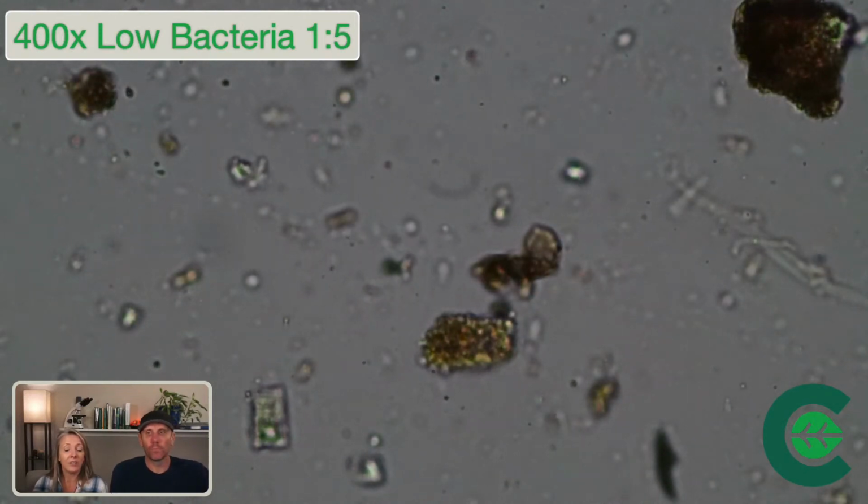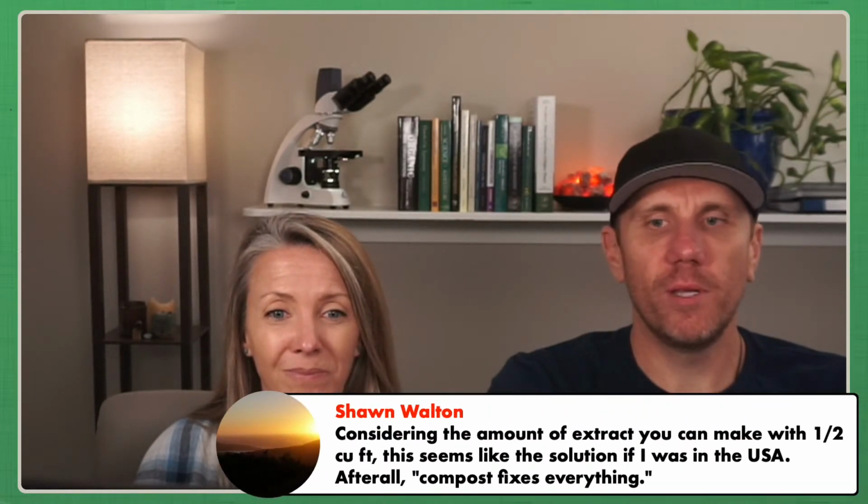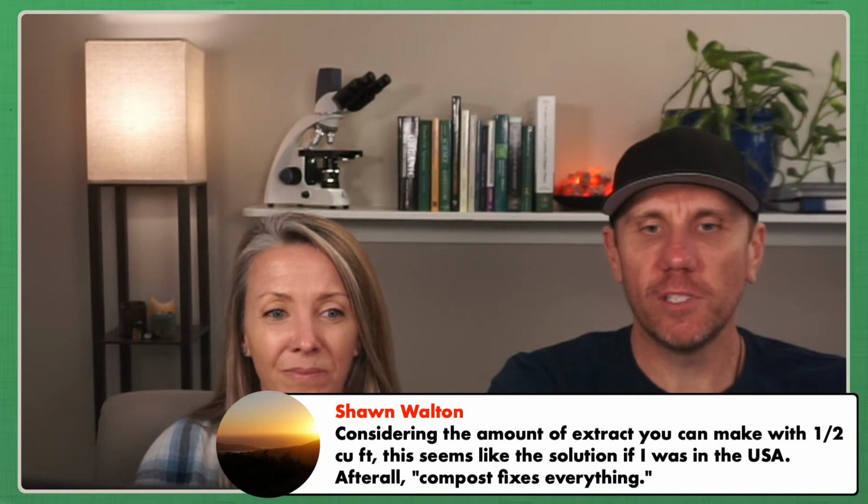Yeah. And so obviously this is just 1 or 2 fields of view of each one. You would need to go through many fields of view in order to really get an idea of everything that you're finding in the sample, to really get an idea of whether you're just at minimum, below minimum, or if you're in the good healthy zone. So yeah, and compost is the solution for everything, in our opinion, really. Fixes most things.